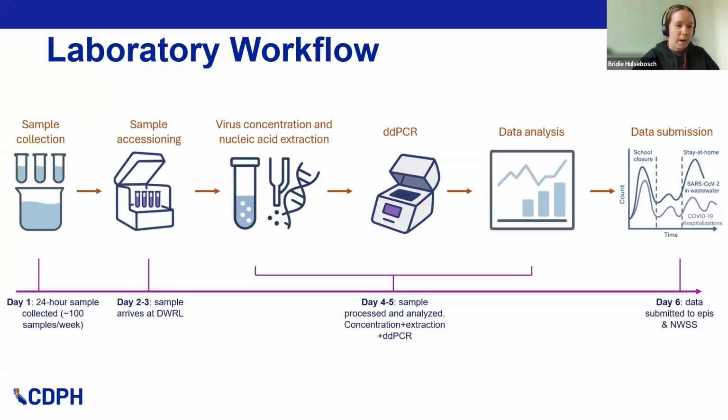And then after those 24 hours, this is generally when the samples will be shipped off to us, and we'll usually receive them hopefully within the next day or two. And so once we receive the samples, we'll accession them. And basically what we do here is we're assigning the sample a unique ID, and that's for us to track it through the workflow and any issues we may have. If we want to see a trend or we got a positive of a rare event, we can go back and easily track the sample and how it went through the workflow and its controls.